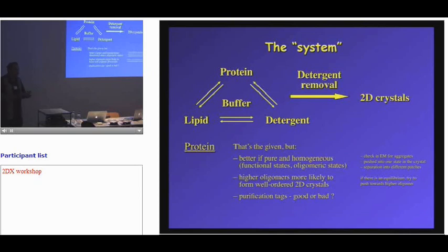If you have a pure tetramer, you should actually have a nice seed to make 2D crystals. Why it then starts to aggregate is actually not very obvious to me. Each protein is different, so you will run into different problems with every protein. But as a basic rule, I think having an oligomeric state.